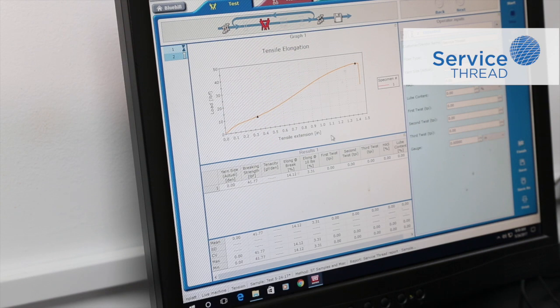For each specific yarn, we typically do at least 9 tests to get a good average of the material.